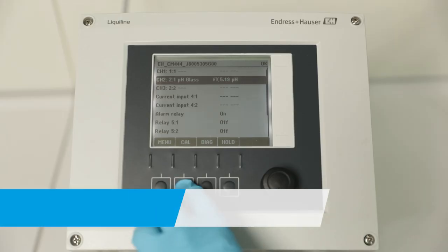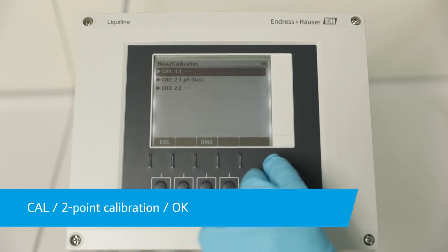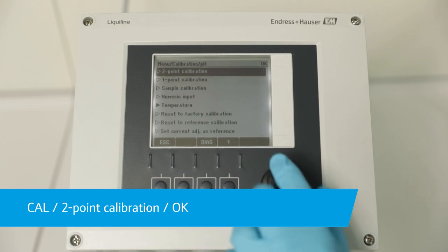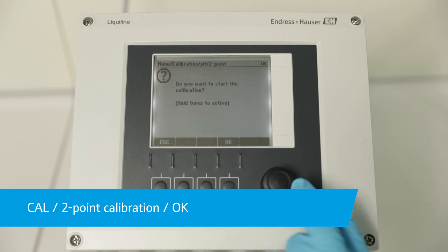Press the soft key Cal, select the right channel, choose and confirm two-point calibration with the navigator, and confirm the start of calibration with OK.